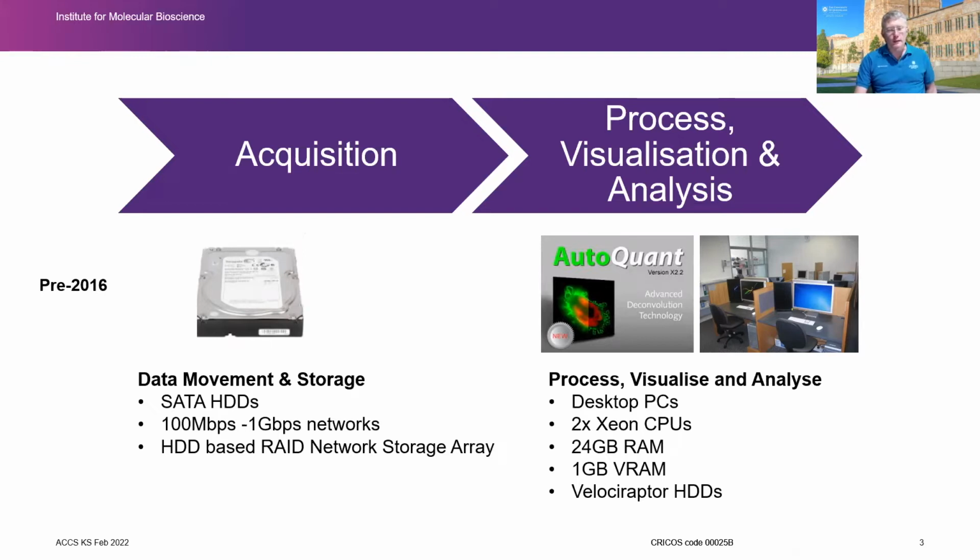The software running on those PCs was generally running on Windows and not typically written for GPU acceleration, and a lot of the processing took overnight or longer to run. Most of these image processing steps that we were performing were actually doubling the data size, and we were doing it multiple times. So we'd also run into issues with constantly moving ever increasing amounts of data back and forth between storage, analysis, and users' laptops.